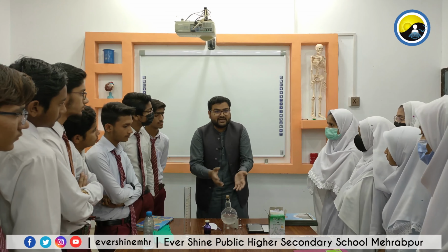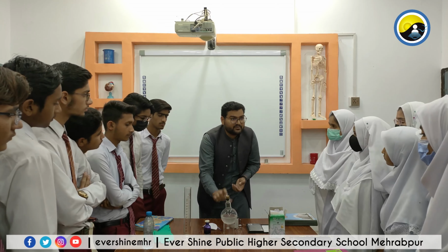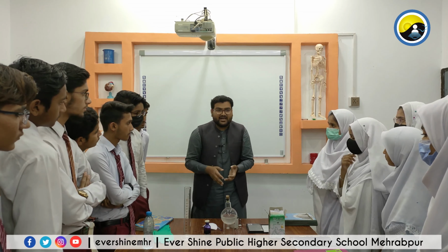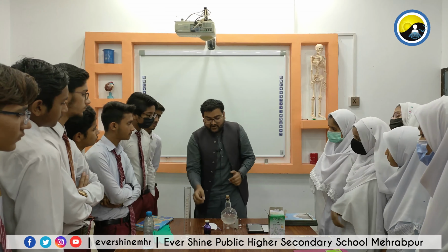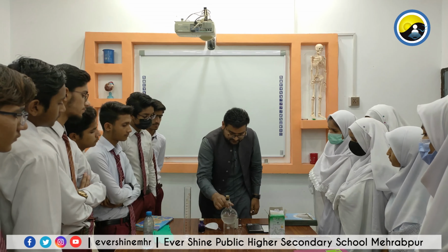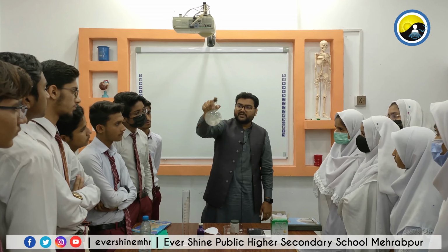How can I oxidize this solution? By mixing it, because oxygen is present in the air. If I mix it well, the solution will oxidize. And when oxidation occurs, what will be the color of methylene blue? Blue. So let's see. We have the colorless solution and now we are going to mix it.